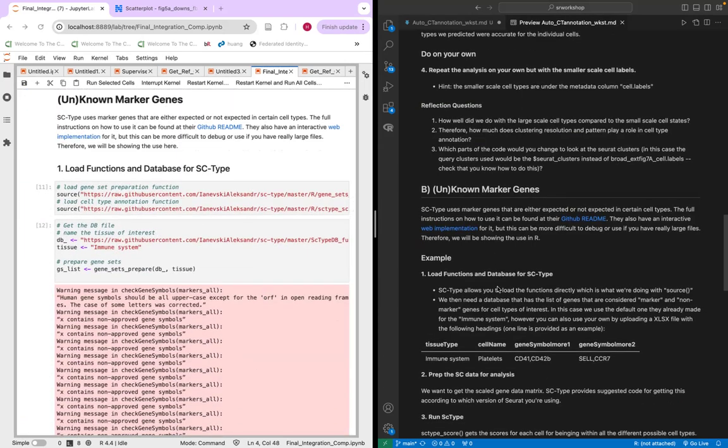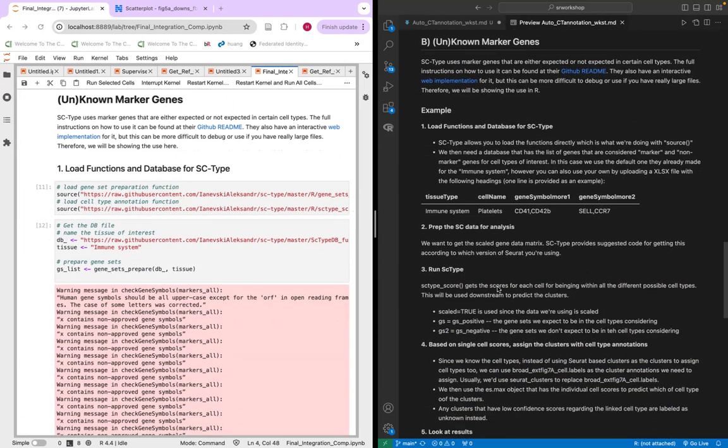So that is with an atlas, but let's say that you don't have an atlas, or you have certain cell states that you think are much more nuanced and can't really apply, they're not being assigned very well. Or you just have some clusters that you would like to annotate according to other compared clusters, or some specific genes that you think are really important and want to look at. That's where these marker genes can come in.